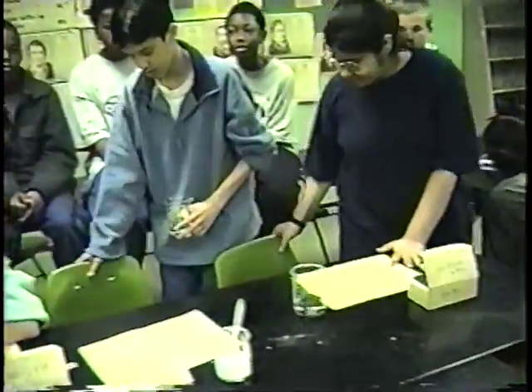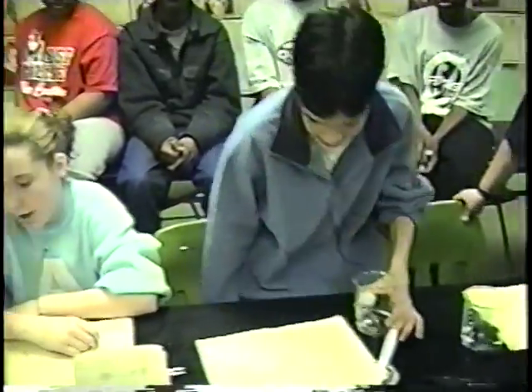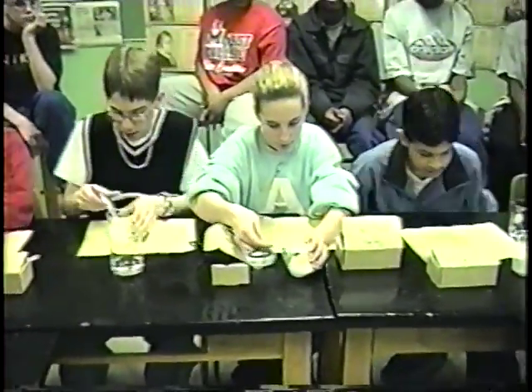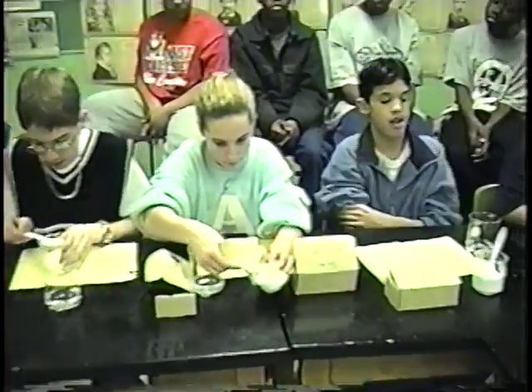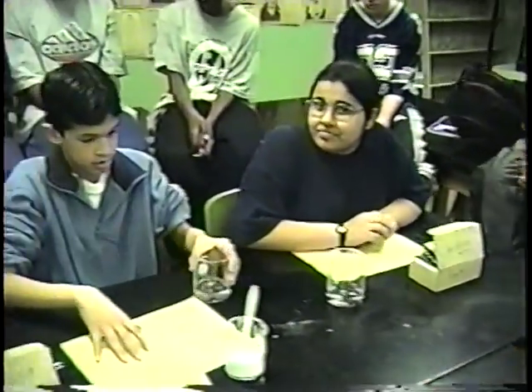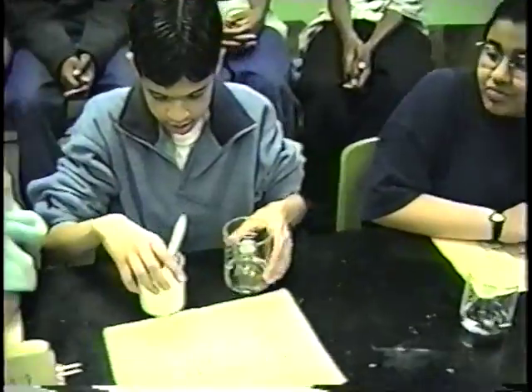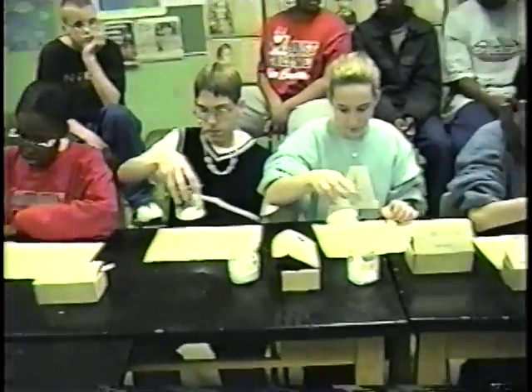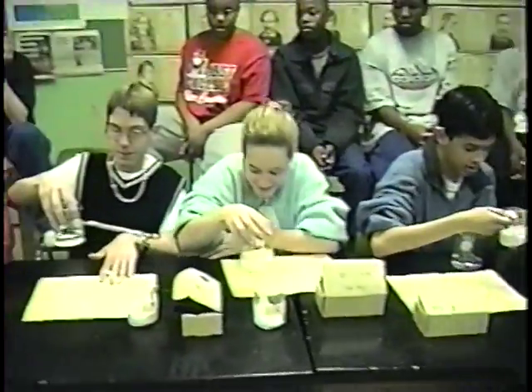All right, so we now have 100 milliliters of water. I want you to take a level teaspoon of the chemical that you're working with, dissolve it into the water, and then swirl it around so we can get some ions being produced, and then we'll test it out and see if it works. Come on now. Kyle, you made a mess.